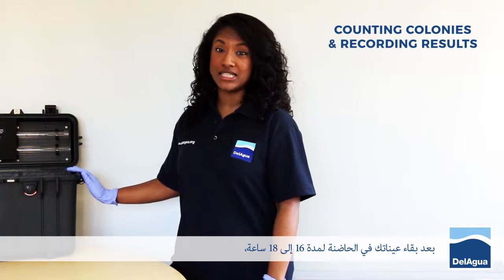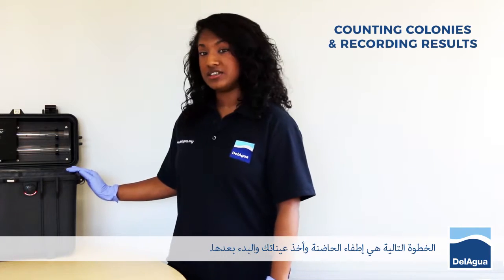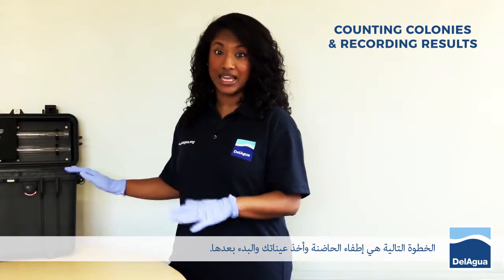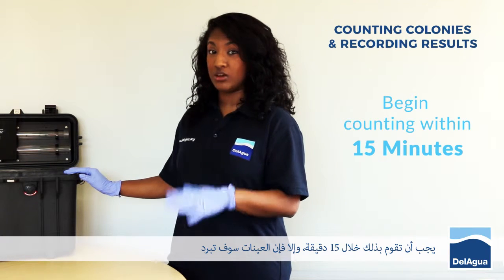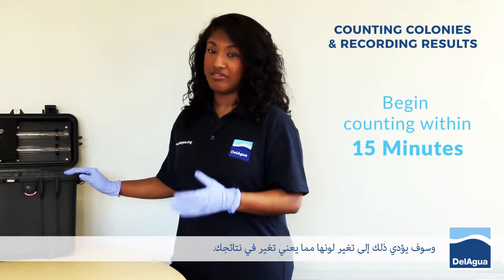Your samples would have been incubating for anything between 16 to 18 hours. The next thing to do is to turn off the incubator and then take your samples out and begin counting them. This needs to be done within 15 minutes, otherwise your samples may actually cool and this may cause the colonies to change colour and will affect your results.